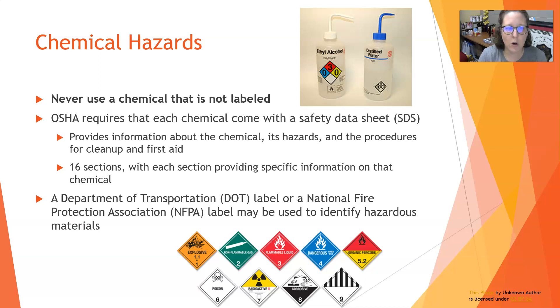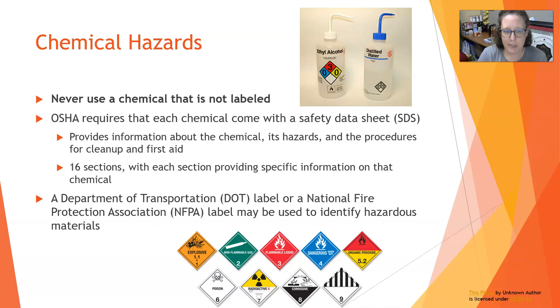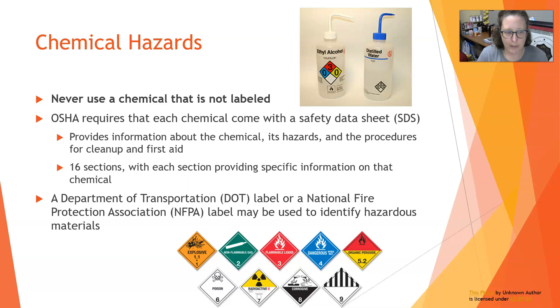Every chemical must be in a labeled container — even water. OSHA requires that each chemical come with a Safety Data Sheet that provides information about the chemical, its hazards, and procedures for cleanup and first aid. These are divided into 16 standardized sections. We can also use a Department of Transportation label or a National Fire Protection Association label to identify hazardous materials.